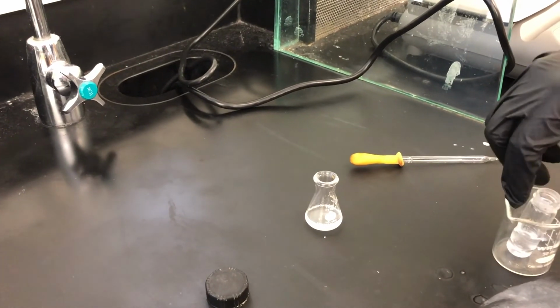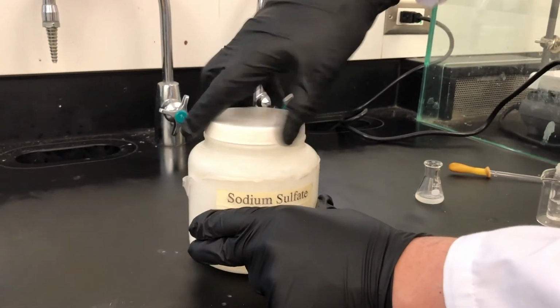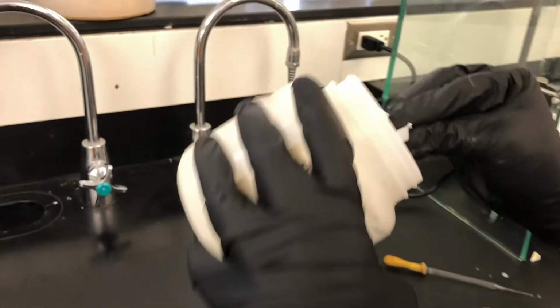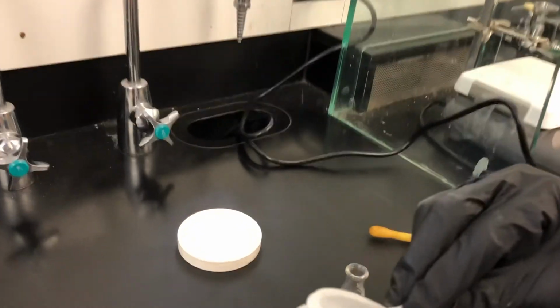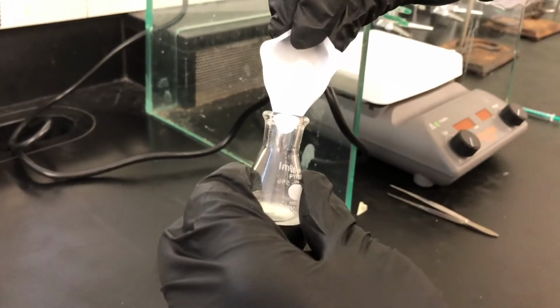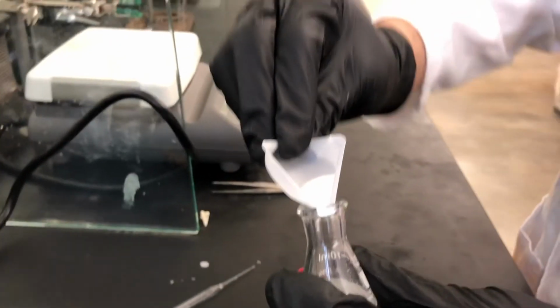Okay, now we're going to use some desiccant. Okay, so here's the sodium sulfate. We're going to use some of this and put it into the Erlenmeyer flask. Just a little bit of this straight into the Erlenmeyer flask. Maybe that will be enough.